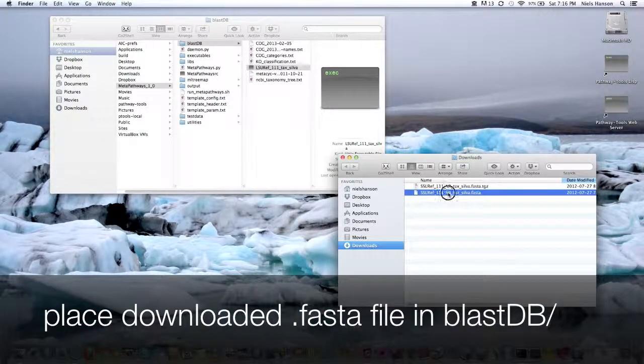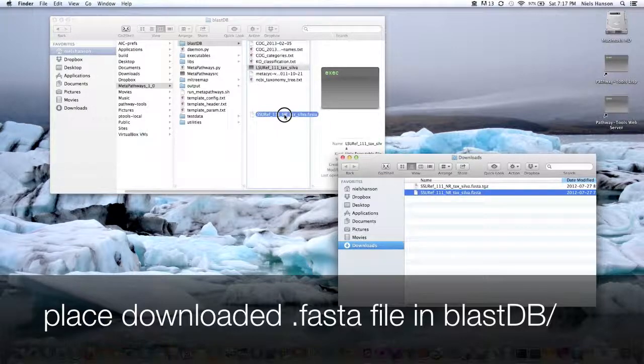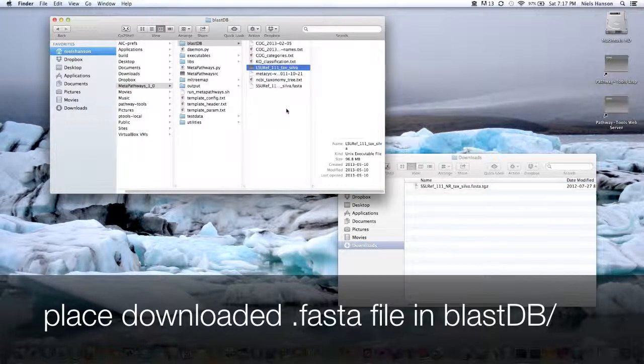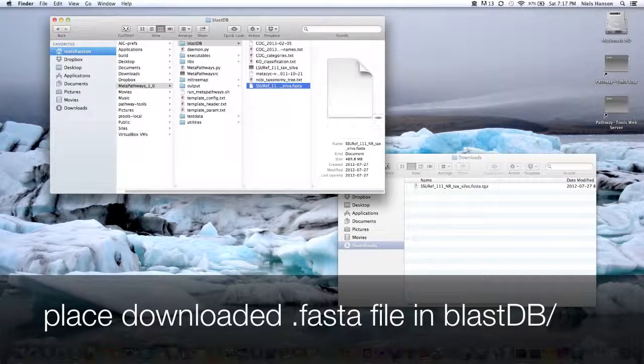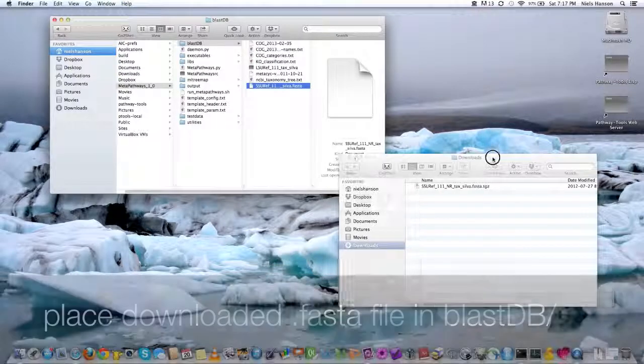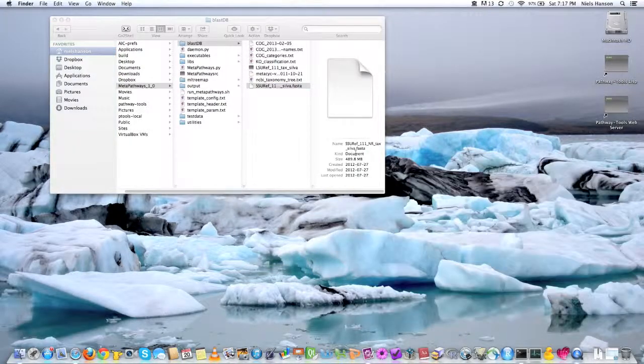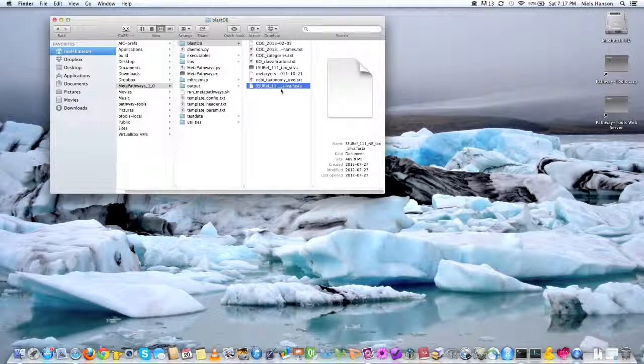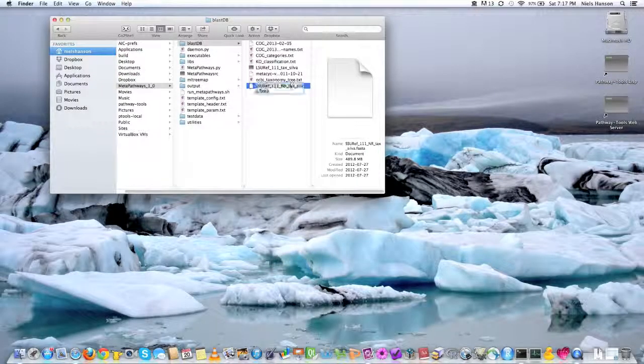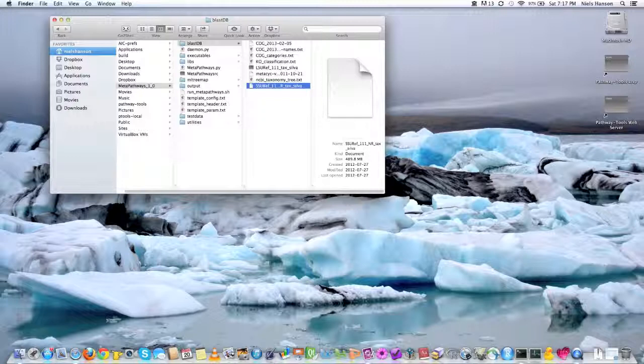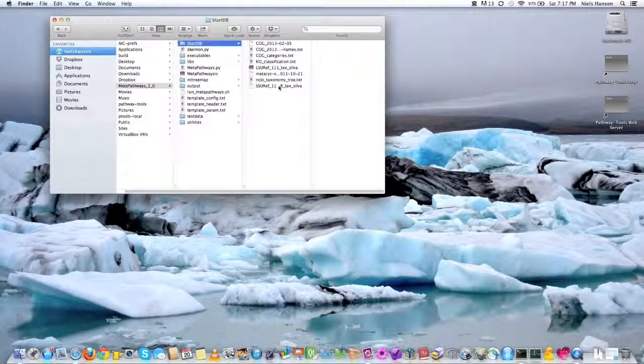And so what you do is you simply just place this file in the blastdb folder. And what I'm going to do is remove that FASTA thing from the end so that it's in the same convention as everything else.